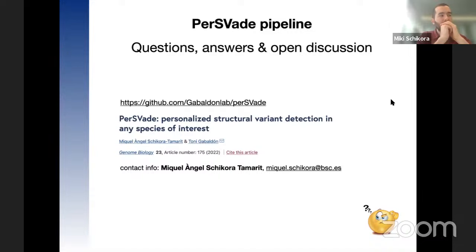I would say probably you want to use the one that is closer. First, there are two things. One is how close is your sample that you're analyzing to this reference genome. Probably the closer is better. But maybe the other one is more far away, but the assembly is worse. So having the best possible assembly is also an important thing.